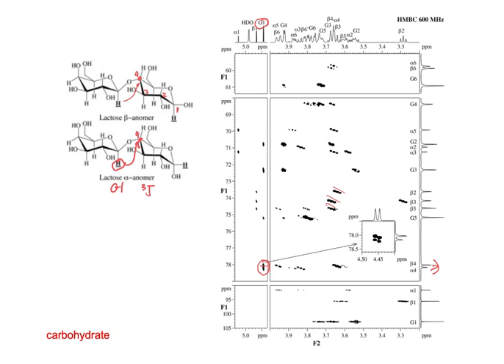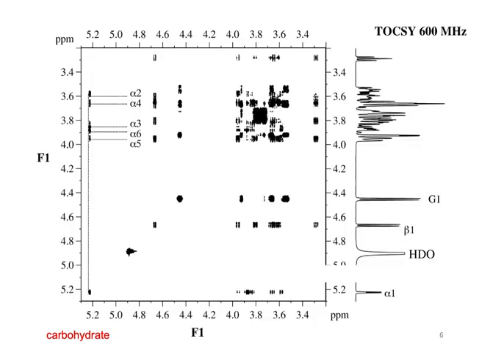Now, ways to separate or to try to spread out these proton shifts are things like the TOCSY. Remember the total correlation spectroscopy, and if we have a mixing time that's long enough, remember that there's essentially a coupling at the beginning, and then it gets relayed along the spin system. So the longer we have the mixing time, the longer that signal will get relayed, and we can essentially do it such that we can see the whole spin system.